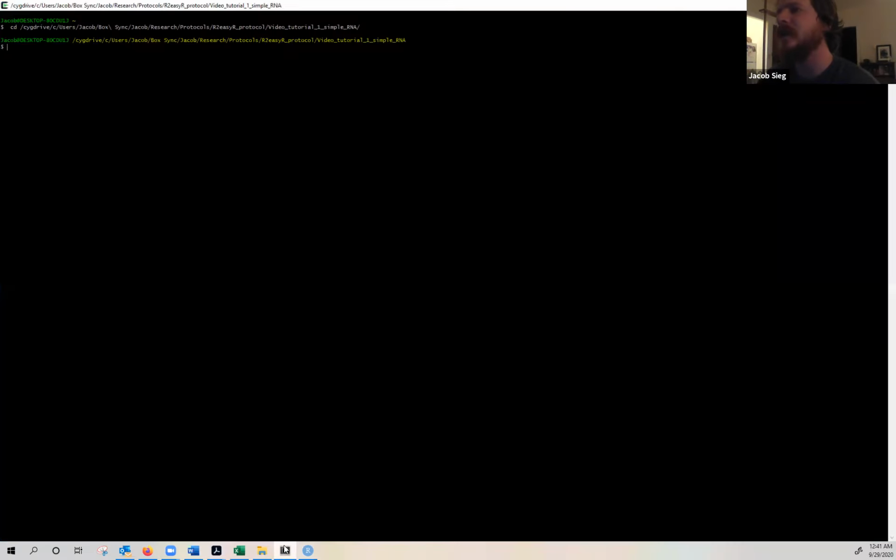And the second is you need to have your terminal up, and you have to have R2R installed because we're going to use R to generate the R2R inputs, and then we'll use R2R to actually draw the figure using those inputs. Mac users have this easy. They can just use their terminal. Windows users like me have to use a bash shell like Cygwin.